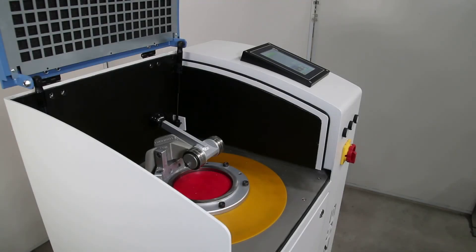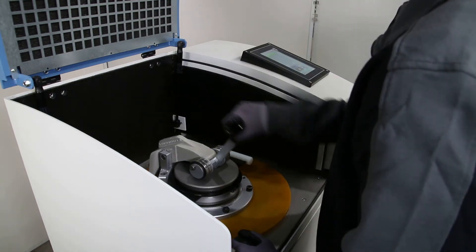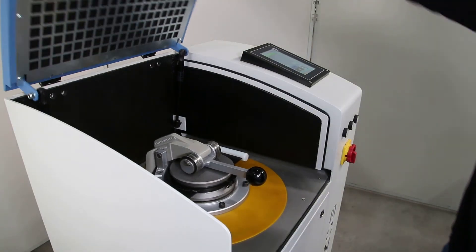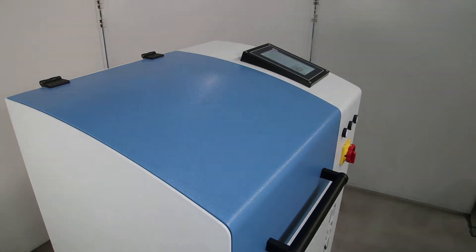In the basic HSM model, the grinding vessel is clamped by means of an easy-to-operate quick-action clamping device. In the optional HSMP variant, the grinding jar is automatically fixed by a pneumatic clamping system. The grinding program can be directly started by pushing one of the three programmable buttons on the machine front.